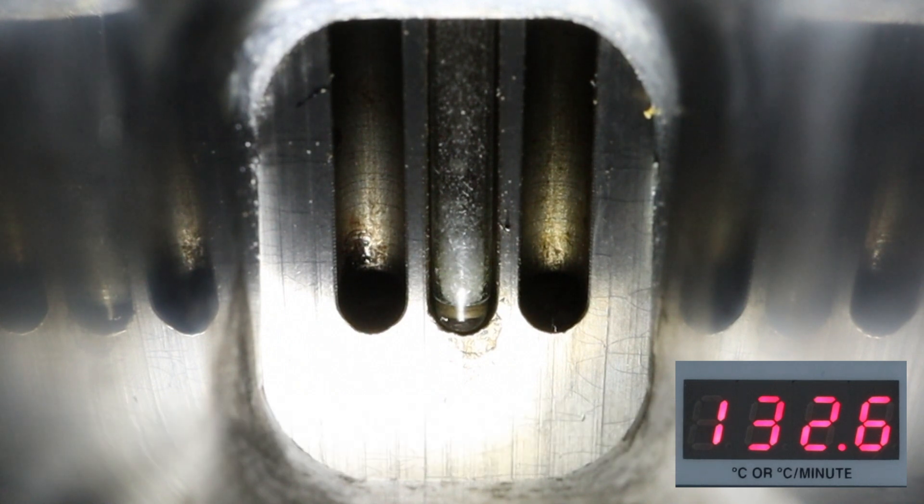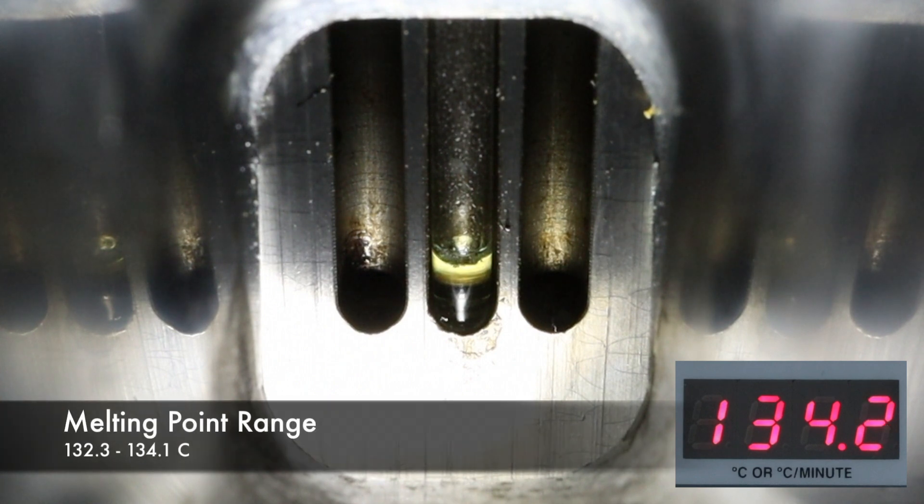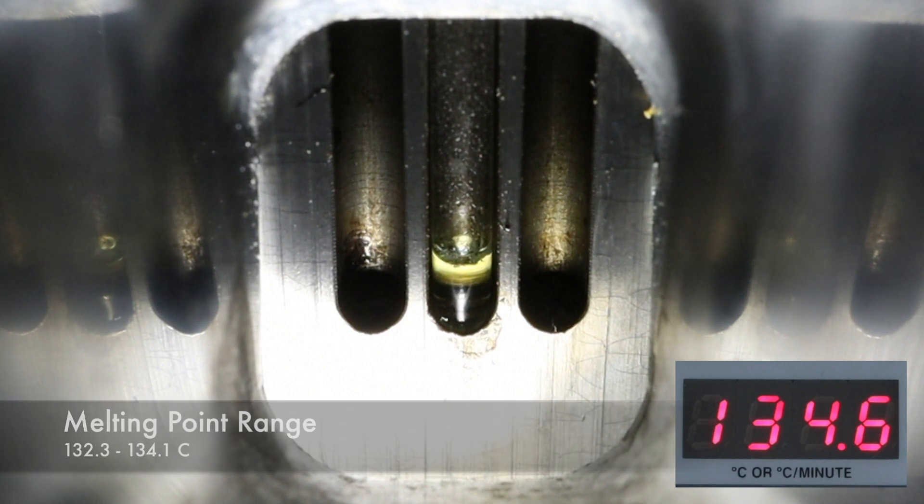Now watch for when the solid completely melts — that will be the upper end of the melting point range. The last few crystals completely melted at 134.1 degrees Celsius, so the melting point range for this product is 132.3 to 134.1 degrees Celsius.